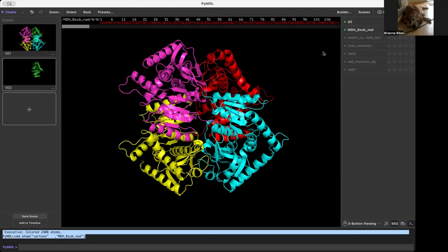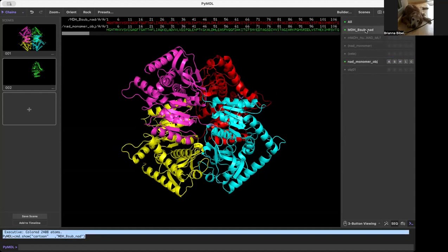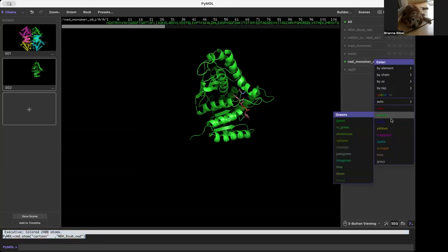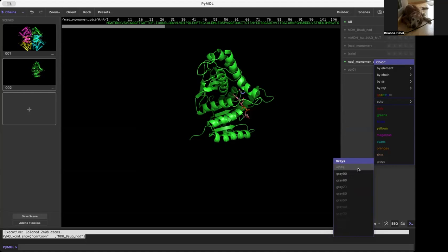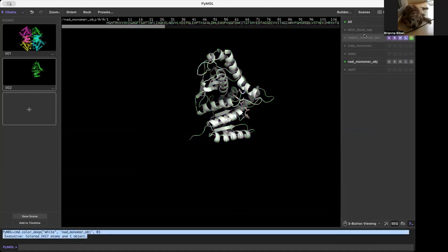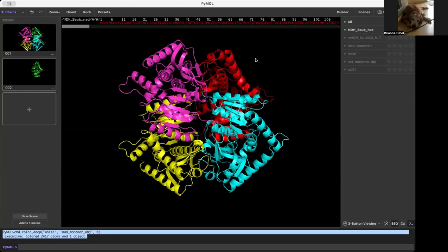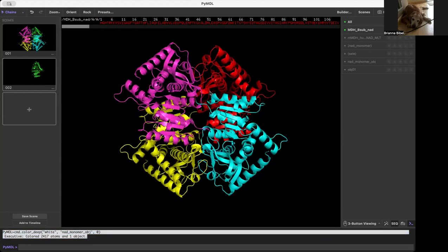This subunit is still going to be showing as red, even though I changed it in the selection. However, if I come to this object — remember in this object we just have this one subunit — and I color it gray or white. Now if I go back to my original structure and turn this object off, you would see it was still that red I colored it before. So when you make changes to an object, it doesn't affect what it came from. But when you make changes to a selection, it does affect what it came from.